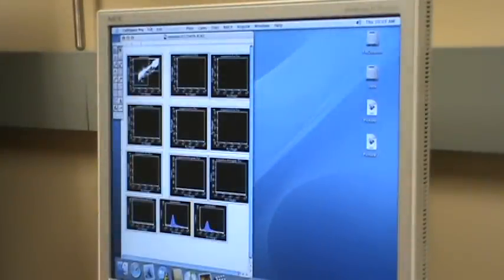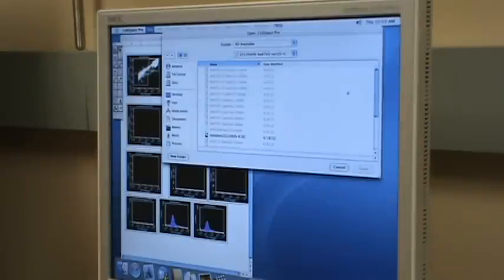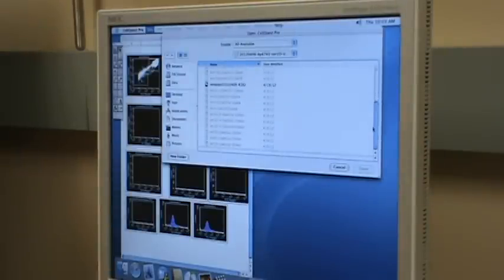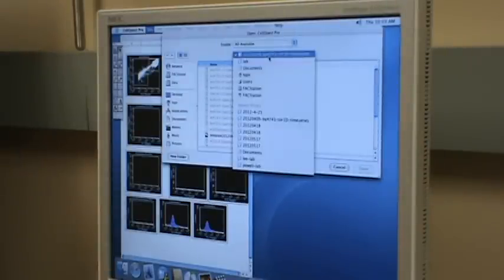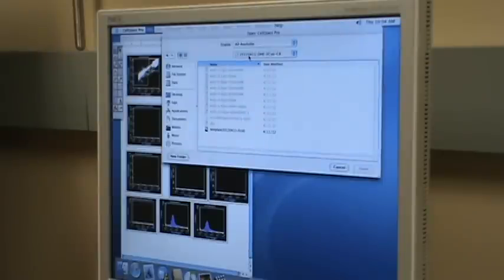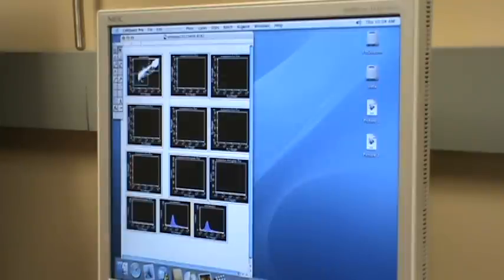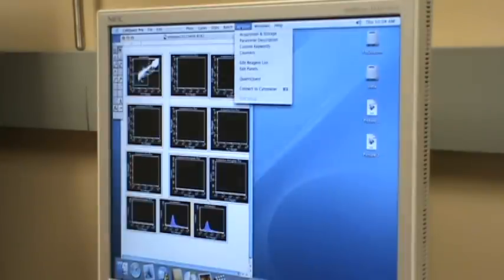This is the lab template. We also need to find the instrument settings of the document. Let me see whether there's an instrument setting here. No. Oh, instrument setting has to be opened in a different place. Sorry. And then you go to Acquire, say Connect to Cytometer.